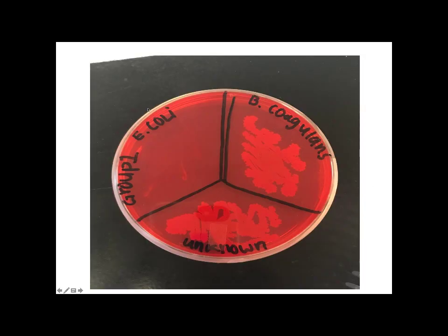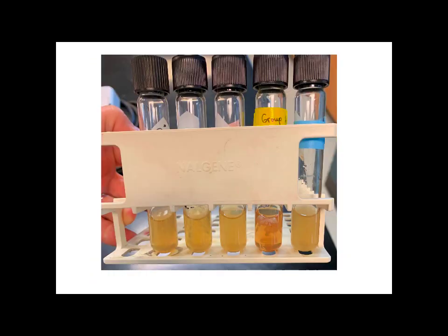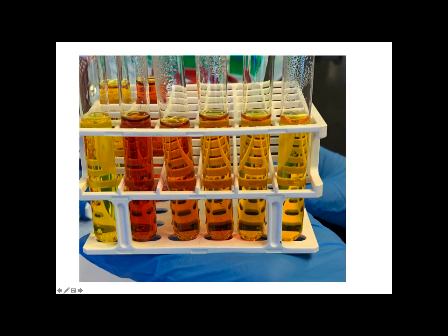Here's one of those tri-streak plates. Make sure that you know which of these is the negative control, which one is the positive control. Make sure that you know how to read them, understand the importance of the CMC Congo red growth medium. Here are some overnight cultures. These are ones that have all completed growing, and in these overnight growth cultures, you can see that they're cloudy. Again, cloudy means that bacterial growth has happened.